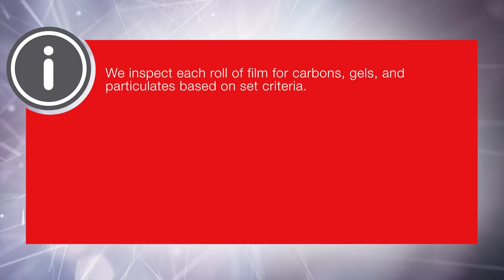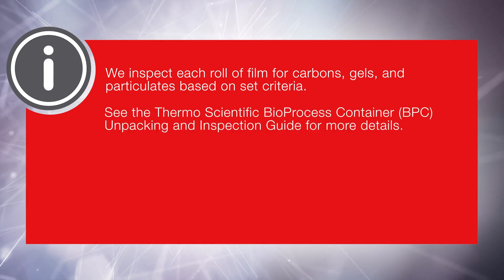Carbon or gel particulate on the film surface is also acceptable. We inspect each roll of film for carbons, gels, and particulates based on set criteria. See the Thermoscientific Bioprocess Container Unpacking and Inspection Guide for more details.